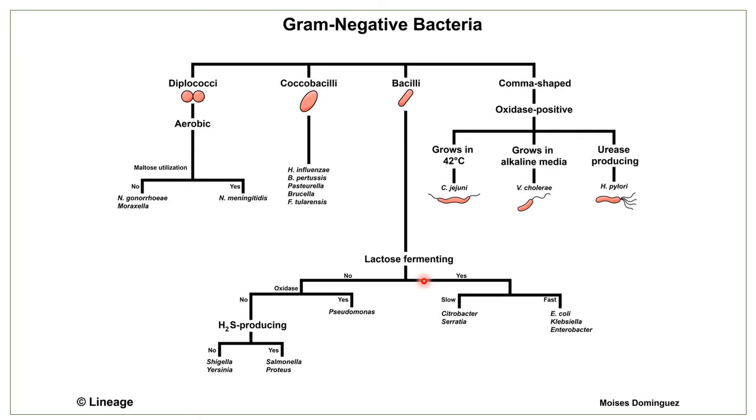In case of bacilli, that is gram negative rod, very simple examples are Shigella, Pseudomonas, E. coli, Klebsiella, etc. These are the most widely used cultures for your practicals at college level, so only those are listed here. But there are different genera present in the group of gram negative rod shaped aerobic bacteria. So what about those? You don't know what is growing on your plate, so you have to consider all and follow Bergey's manual for biochemicals.